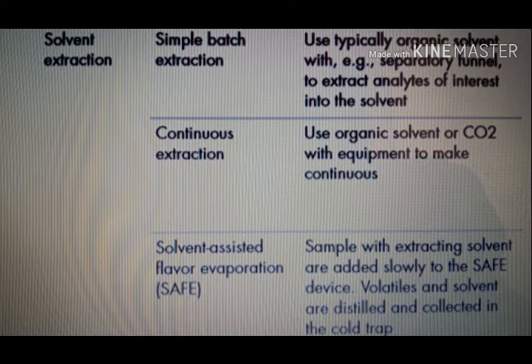Simple batch extraction typically uses an organic solvent, for example diethyl ether, to extract analytes of interest into the solvent. While continuous extraction uses an organic solvent or CO2, carbon dioxide, with equipment to make the extraction continuous.